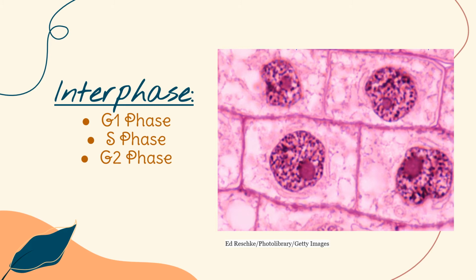So, in the latter part of interphase, the cell still has nucleoli present. The nucleus is bounded by a nuclear envelope, and the cell's chromosomes have duplicated but are in the form of chromatin.